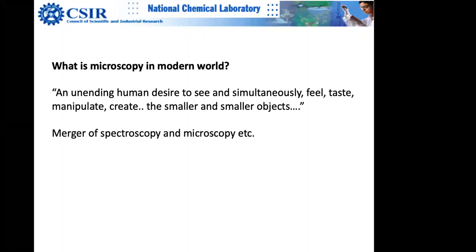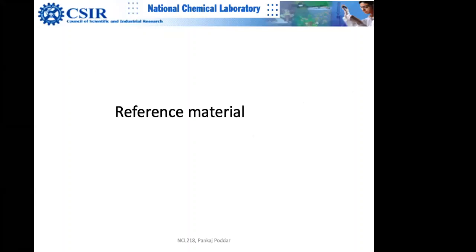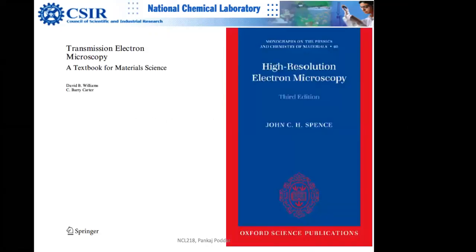As you know, there is a vacuum inside the electron microscope. The surface melting point is quite different from the core melting point, as all of you are aware. So one has to be very careful that you may modify the sample, because the surface starts melting, especially for some of the metals. There is a lot of curiosity around this field, and you can do a lot more. And obviously, there were a lot of Nobel Prizes given in this journey of several hundred years of microscopy at large. I would like to show some references.